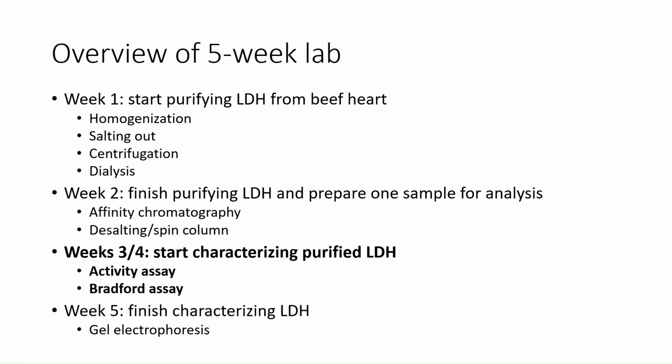So just as an overview, in the first week, we started purifying LDH from our beef heart samples. We did this using a number of different purification techniques, including homogenization, salting out, centrifugation, and dialysis. Then last week during week 2, you finished purifying LDH using affinity chromatography, and then you prepared one sample for analysis using that desalting spin column.